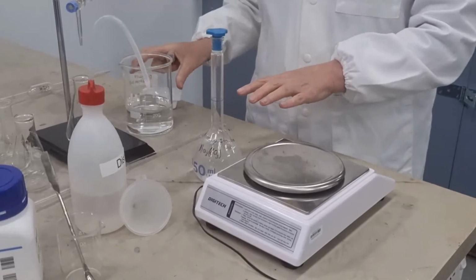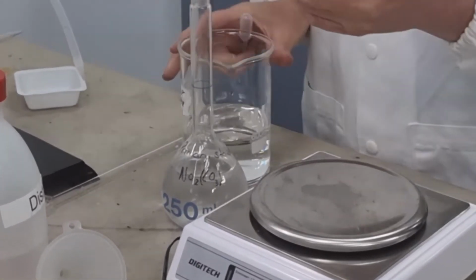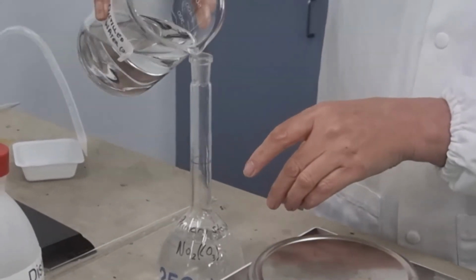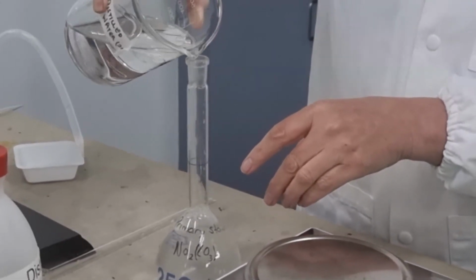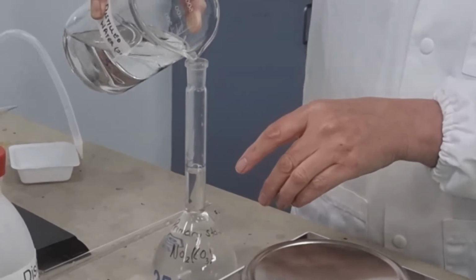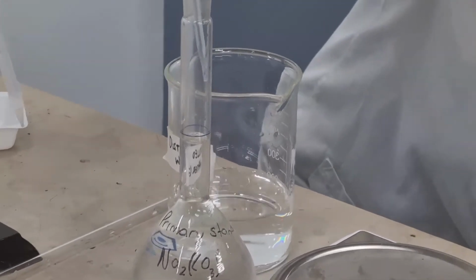So now that it's dissolved, now we can make it up. So if I just take this off for a second, and we're adding distilled water, so carefully we'll make it up to most of the way. So we want to get it up to this line, since it's just distilled water. Slowly, slowly, slowly, slowly. And then when we got nearly to the end, then we just use a little dropper so that we can do it carefully.